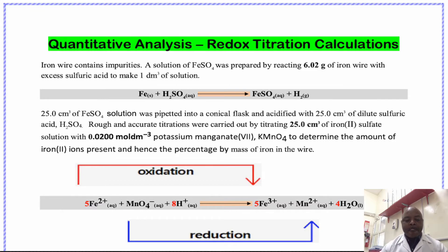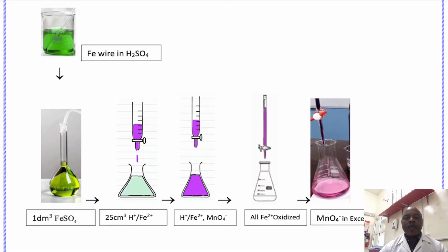We have the iron wire, potassium manganate(VII), dilute sulfuric acid, and other reagents. The first stage in this experiment is the preparing of iron(II) sulfate by dipping the iron wire into the sulfuric acid solution in a beaker.